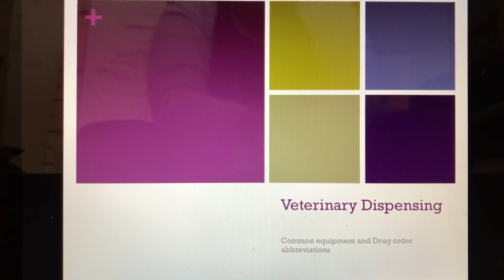And welcome to a video lecture for veterinary dispensing. This lecture is going to be talking about common equipment and drug order abbreviations.